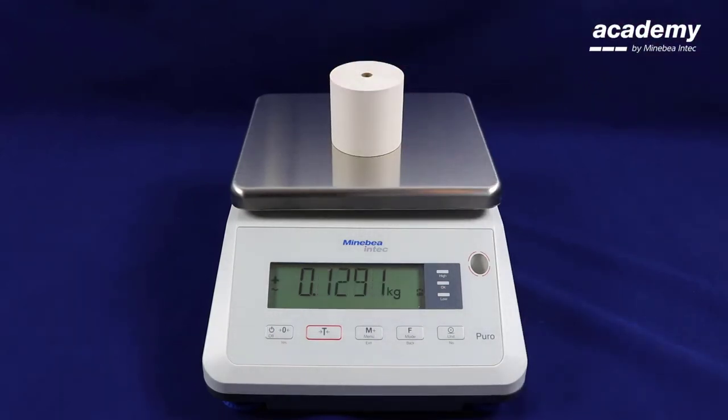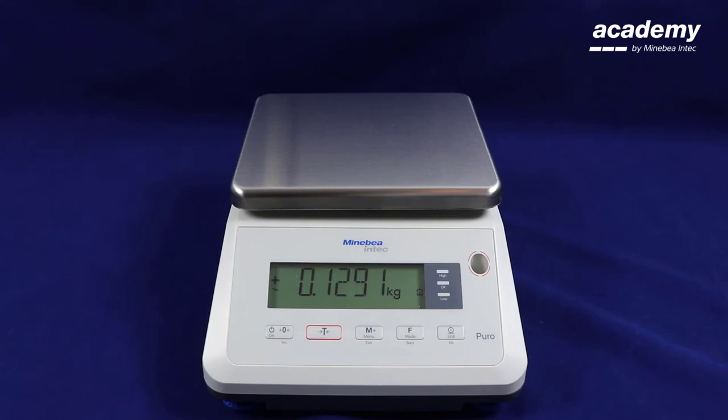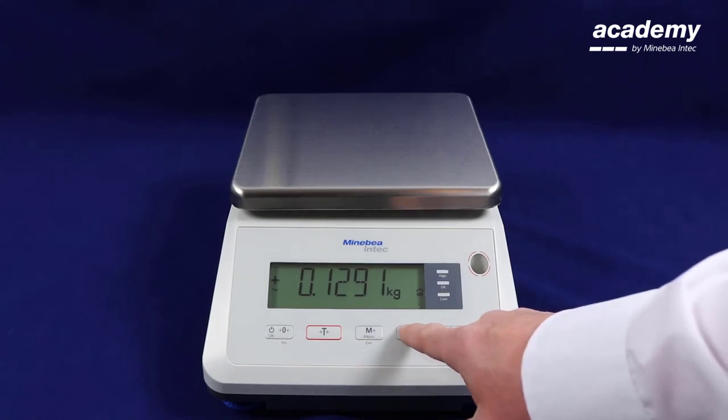Again put your sample onto the weigh pan. When you remove it the weight will remain. In order to unlock the scale press the function key.